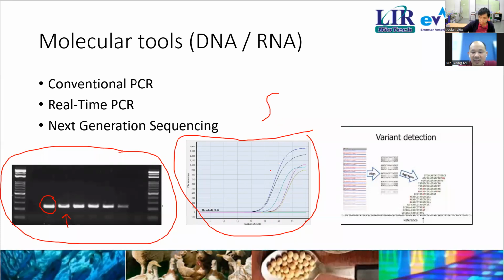With the use of real-time PCR, we can actually do quantification already. So we can do more things, such as on the medical side, where they are doing drug analysis to see whether a gene is suppressed or not during treatment.